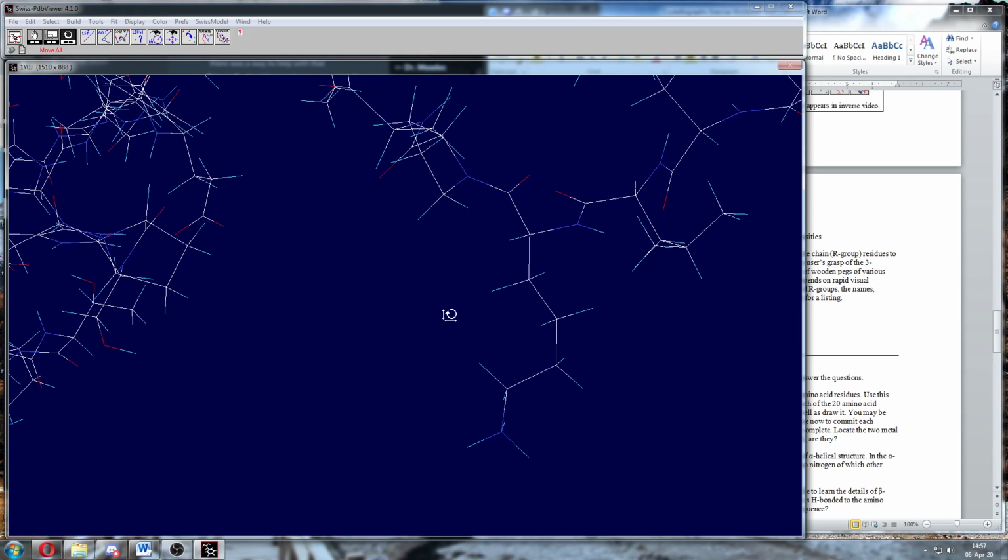We could not see them in the X-ray structure, and why is that? Well, how did we get the structure through X-ray crystallography? We shot an X-ray beam at it. The X-rays interacted only with electrons, not the nuclei. And if you have a hydrogen attached, where does the pair of electrons in that covalent bond spend the vast amount of time, or have the highest probability? Not around the proton, right? Around the other element. So you don't see them in X-ray crystallography.